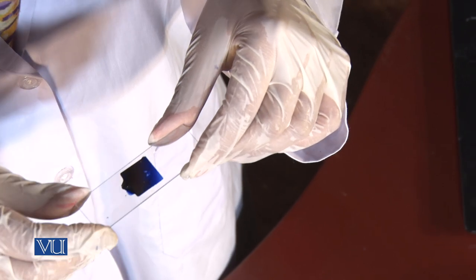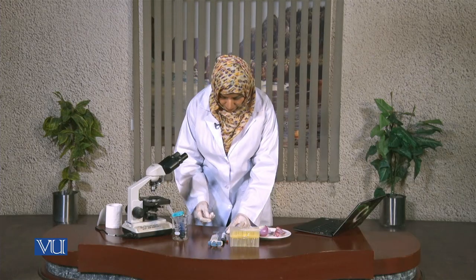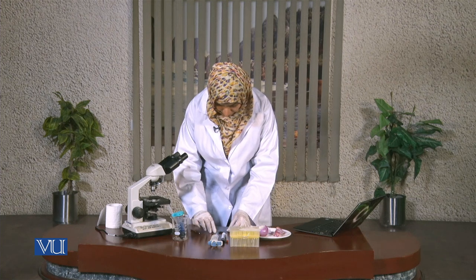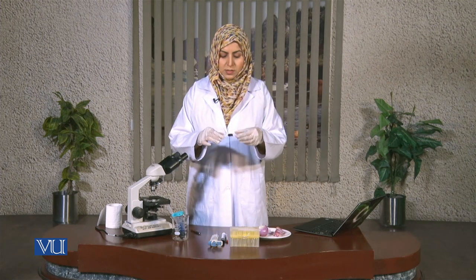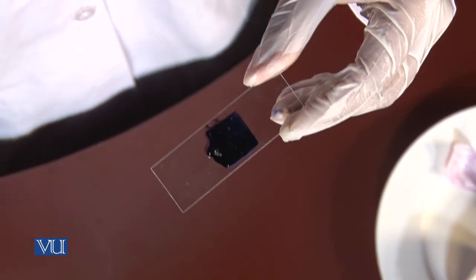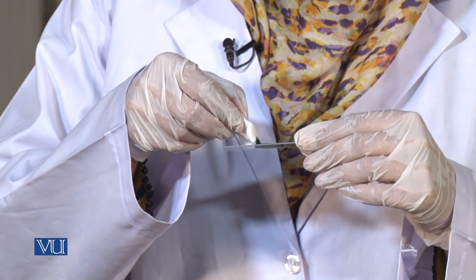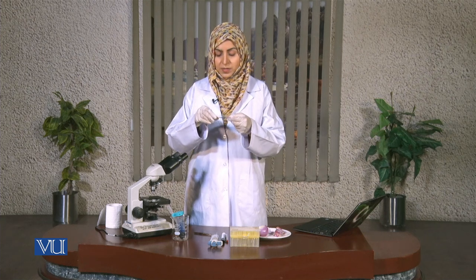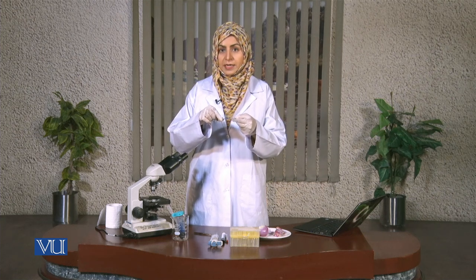If there are any bubbles they can be removed. You can see there is some extra stain on the slide — I have to remove it now with the help of paper. Now the slide is ready for observation. We should put it on the stage of the light microscope.